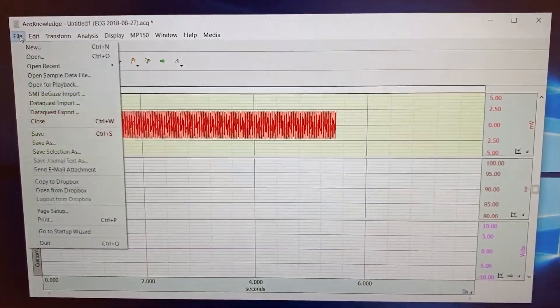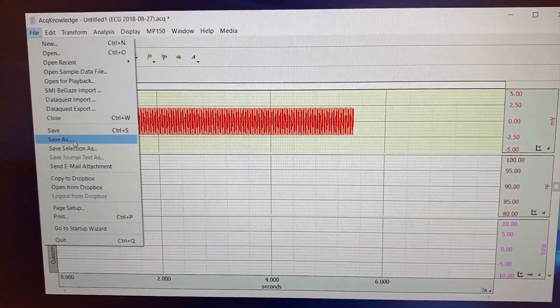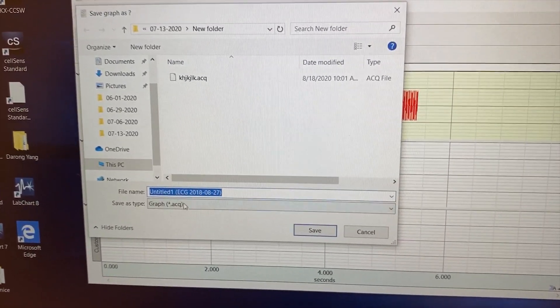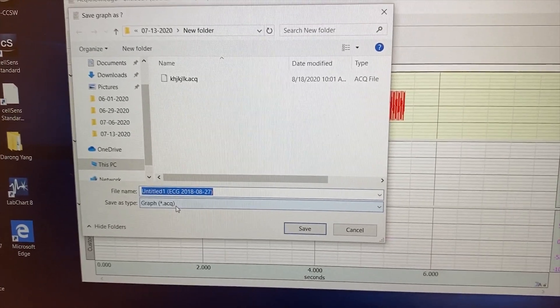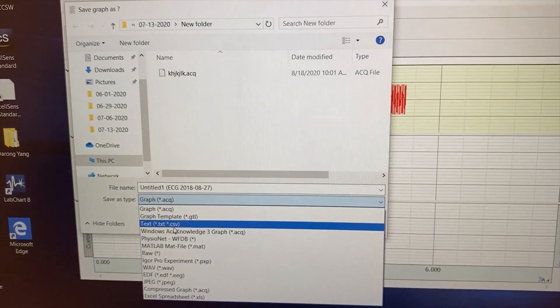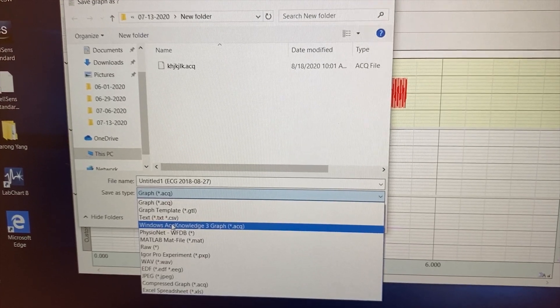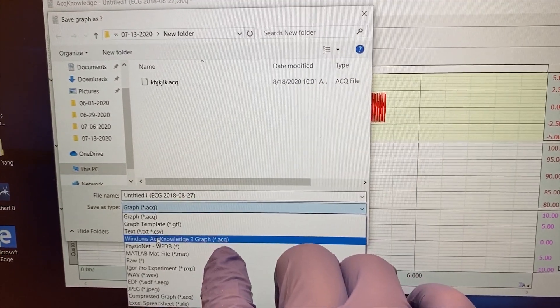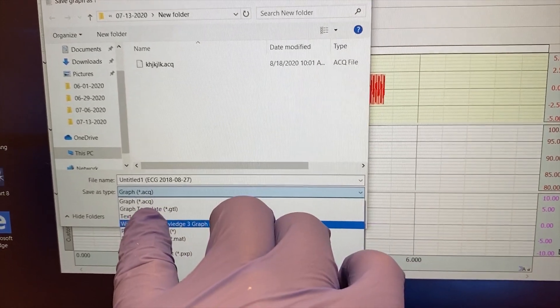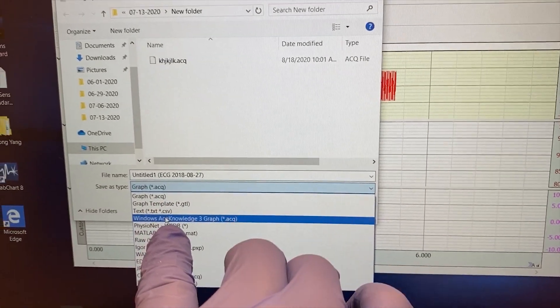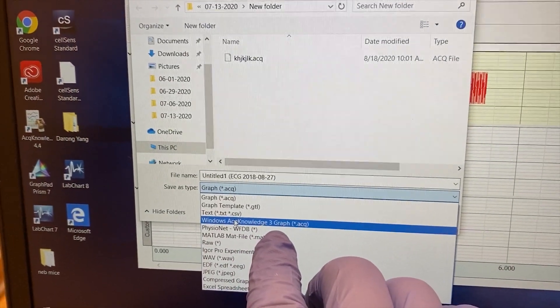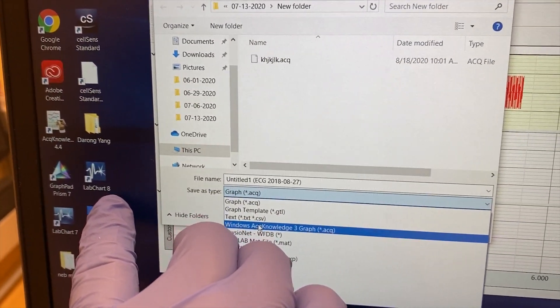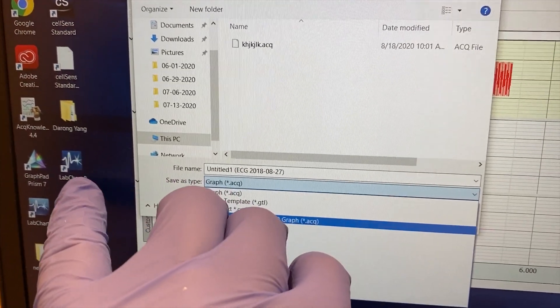Here use file save as. Here is a very important thing. It's to select the file type. You must select the Windows AcqKnowledge 3 Graph. So you can see here the ACQ and the ACQ the same, but different. If you use the Windows AcqKnowledge this file type, you can analyze it using the LabChart. If not, you cannot open in LabChart.